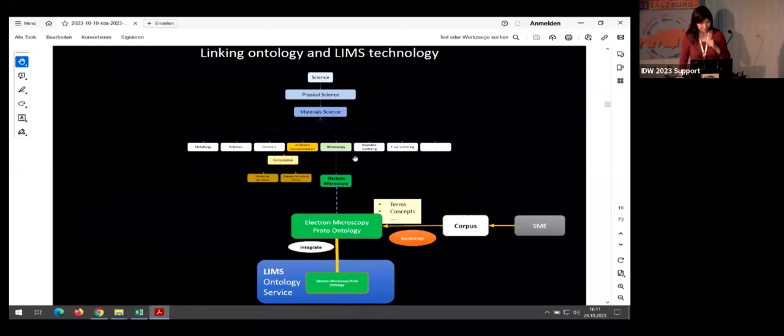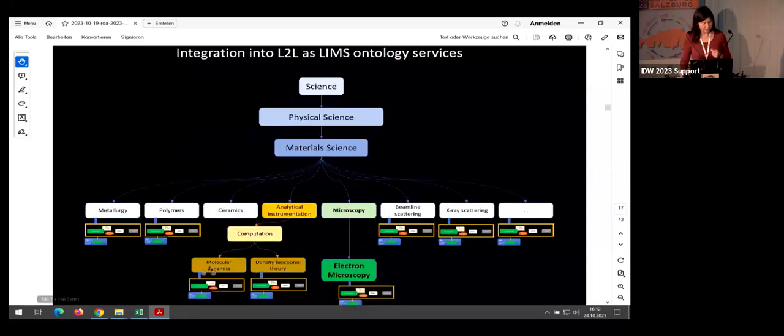So I think the point here is we bring back the LIMS, right? The way I think about LIMS is really at the bench level. We're trying to manage content that's being created from the laboratory, whether it is from an analytical instrument or maybe you're doing compute, right? The LIMS is really what's feeding the knowledge upwards. So you could imagine that this echoes a little bit closer to some of the LIMS to LIMS work from the previous talk, except maybe the realization that we had was maybe the communication level isn't at the LIMS to LIMS level. Perhaps it should be coordinated elsewhere, perhaps at a higher level.